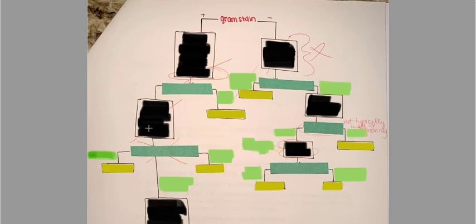So then this person said, okay, if I now have these organisms, what test could I run to separate them further? So then they said, I'll run this test, and this test, it looks like, would give 3 different answers, perhaps. So if it gave this answer, then we knew that we had this organism. If it gave this answer, then we knew that it would have this organism. And the this answer part is what I have underneath the lighter green here. So under the lighter green, it would say, for example, positive or negative. I just didn't erase it up here in the gram stain area so you could see what I'm talking about.